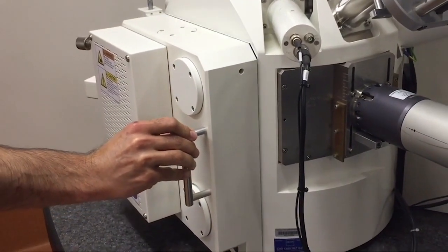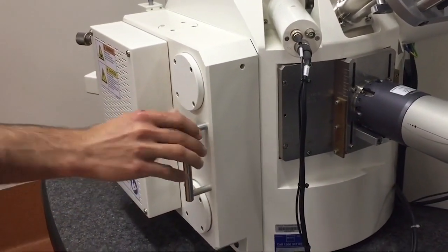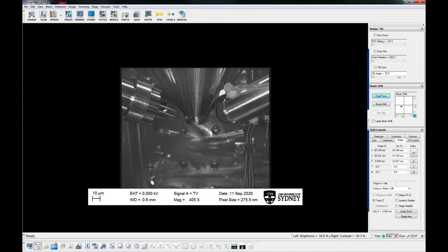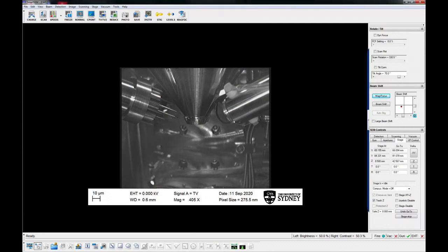Carefully close the chamber door and pump the system by selecting vac and pump. Minimizing the time open will help maintain a clean system. Remove glove.